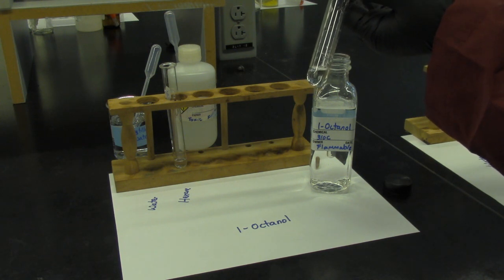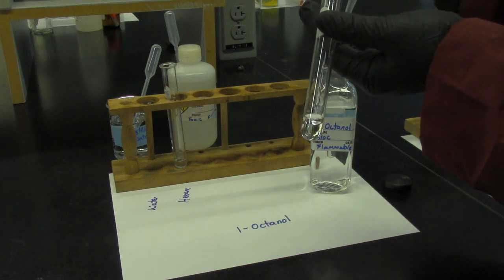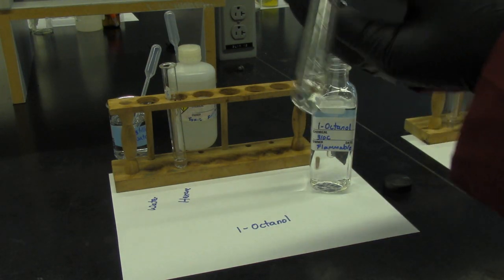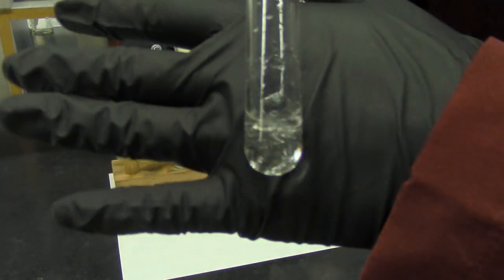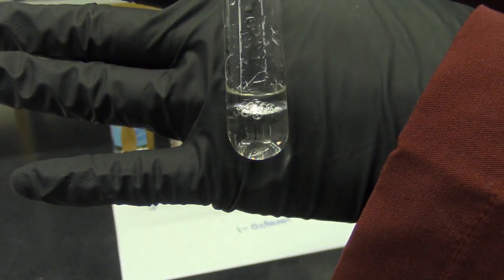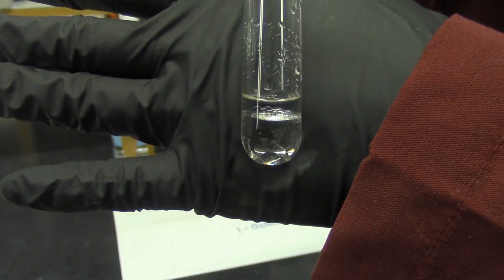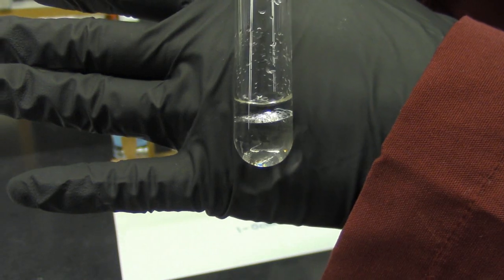Six, 7, up to 14, 20 drops of octanol. Shake, shake, shake. Take down the observation.